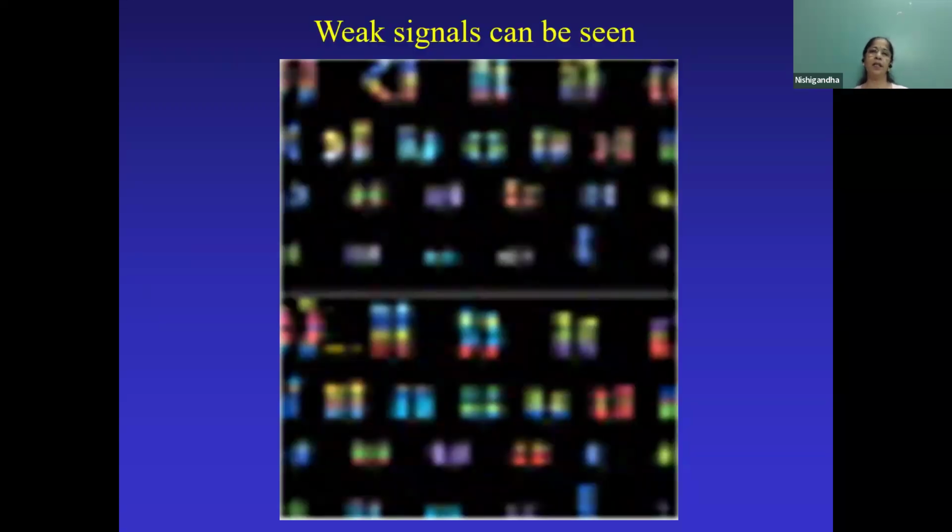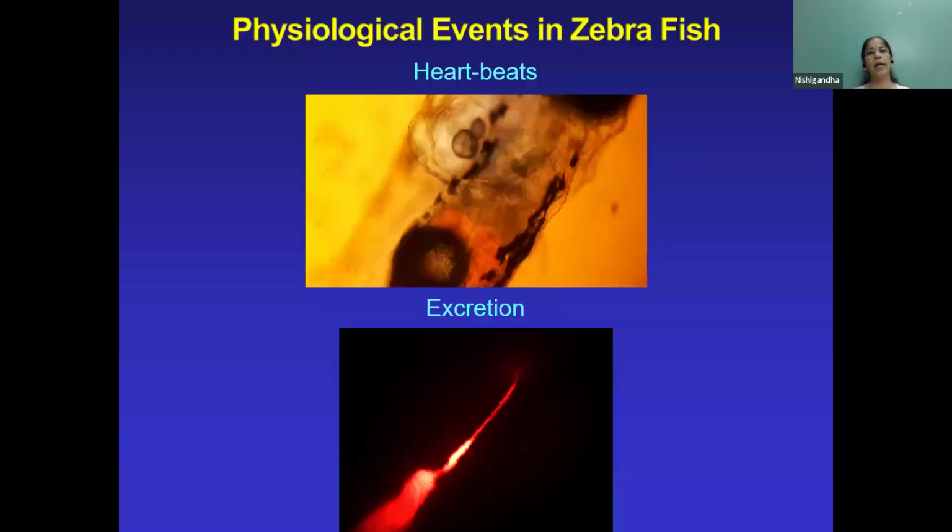Sometimes you have very weak signals, like if you want to do karyotyping. When there are weak signals, you can use spectroscopy, but if the signals are weak, then again identification of the chromosomes is very difficult. But if we have a laser-confocal microscope, you can do karyotyping by enhancing the weak signals with the help of the laser-confocal microscope. I had mentioned small animals.